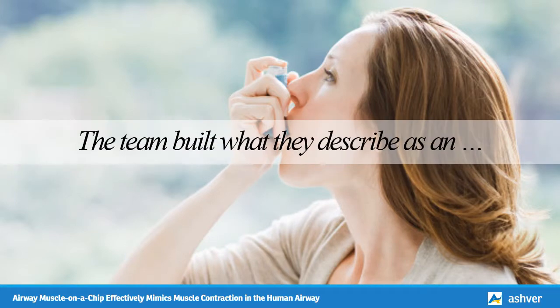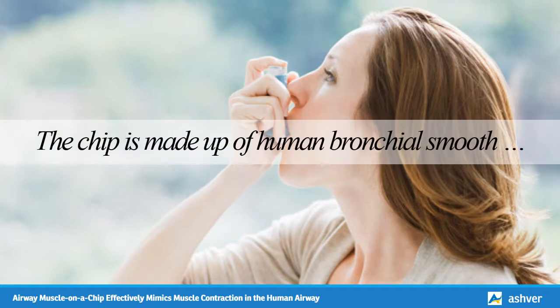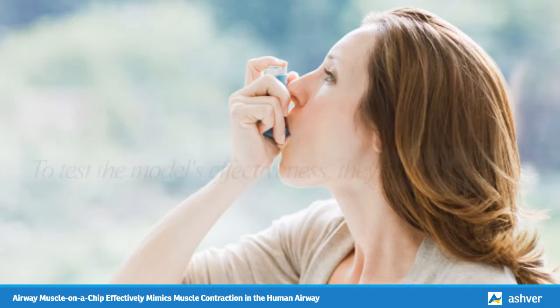The team built what they describe as an airway muscular chip mounted on a glass substrate. The chip is made up of human bronchial smooth muscular thin films, BMTFs. These consist of a bottom layer of elastic polymer polydimethylsiloxane, PDMS, and a top layer of engineered bronchial smooth muscle. When the muscle layer contracts, the BMTF bends, reducing the radius of curvature of the tissue, the researchers explain.